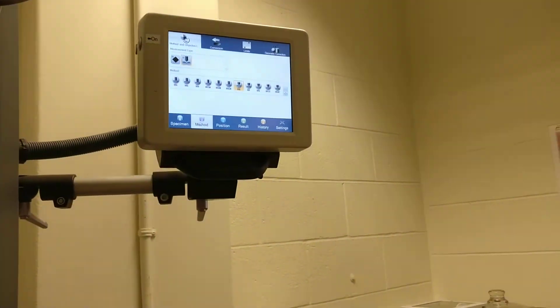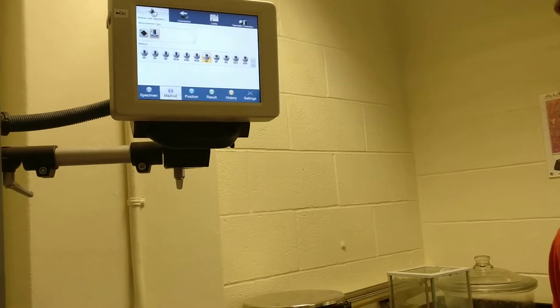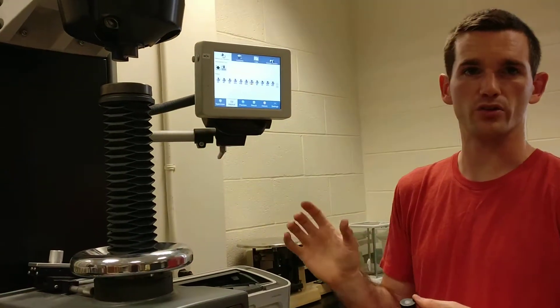So this is a low-carbon steel — I'm assuming it's kind of soft. If you don't know the hardness of your sample, you want to test with the harder indenter first, because with the steel ball indenter, if your sample is harder than that you will dent the steel ball, and you don't want to have to exchange that.